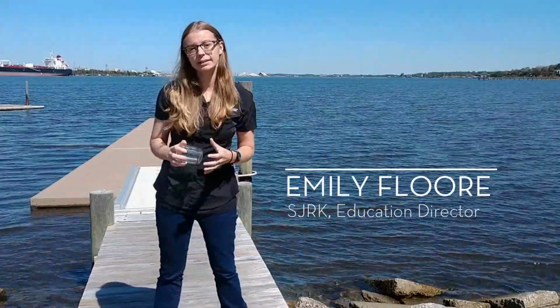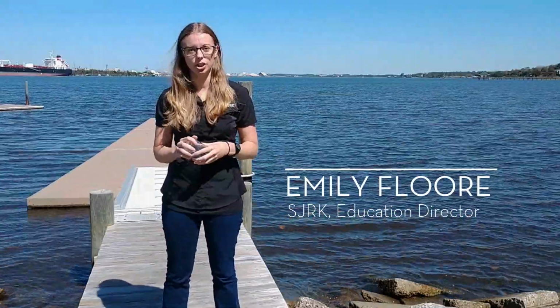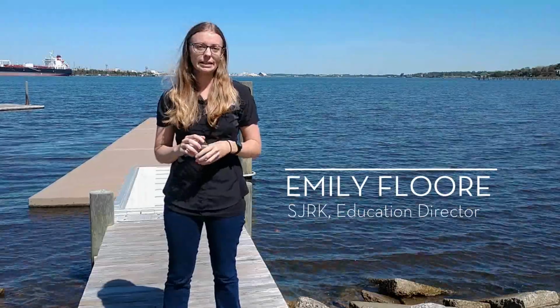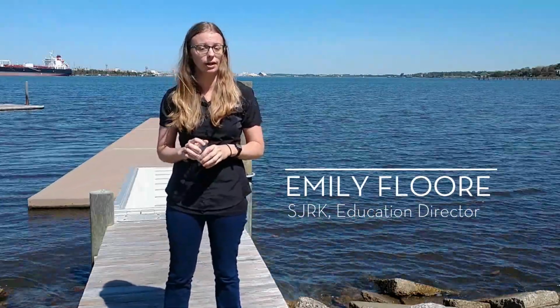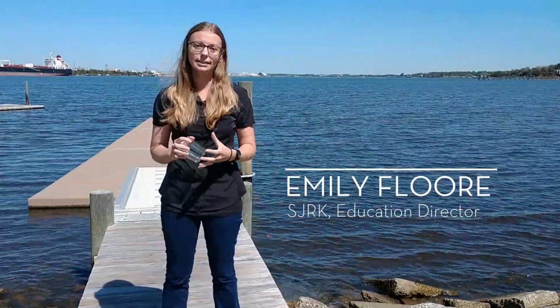I'm at Jacksonville University today. I'm going to test the amount of nitrogen in our St. Johns River today. We've recently received a report of algae blooms down in the San Mateo area near Palatka. So I want to see how many nitrates are in our water and if there's a potential for algae blooms here.